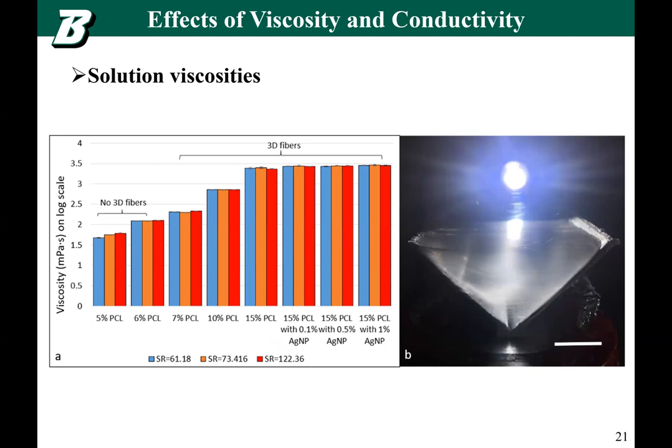the central area. So this means the central area of the scaffold may not have sufficient fibers for cells to grow. So we are wondering if we increase the solution viscosity or solution conductivity, can we overcome the electrostatic repulsion force between the deposited central fibers and the peripheral fibers, so that we can deposit more fibers in the central area and get a more homogeneous scaffold overall? But we still want the gradient features, of course. And also we're just curious, if we decrease the solution viscosity, will we still get fibers in 3D space?